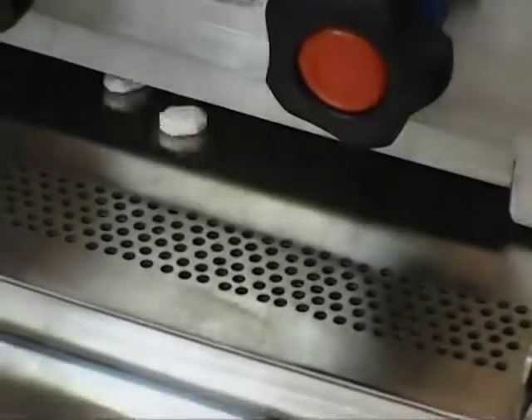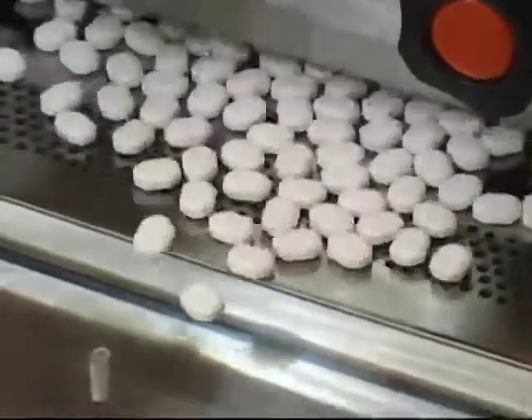This is the organized way of inspecting a batch of tablets for logo defects or chips. This is a different angle of the machine running.